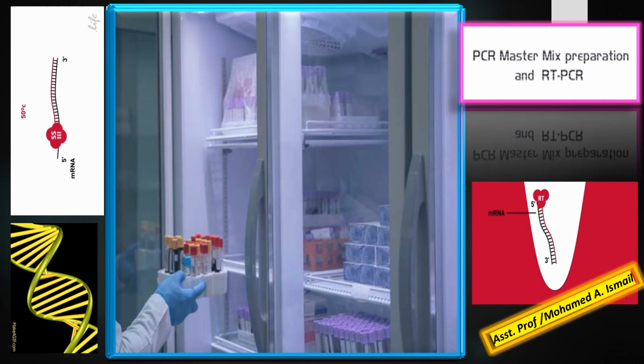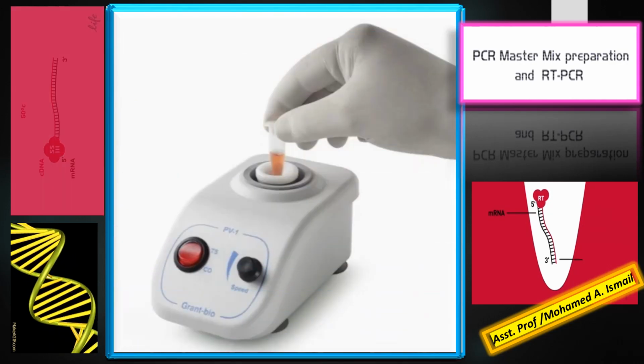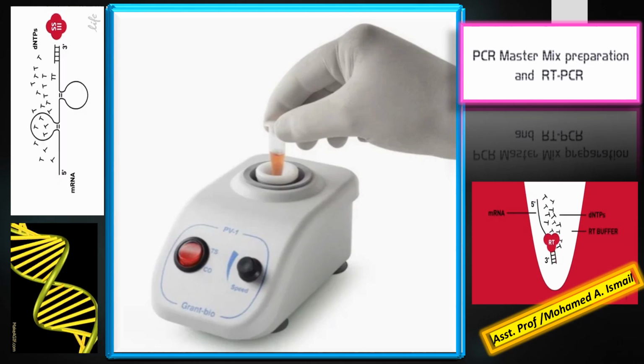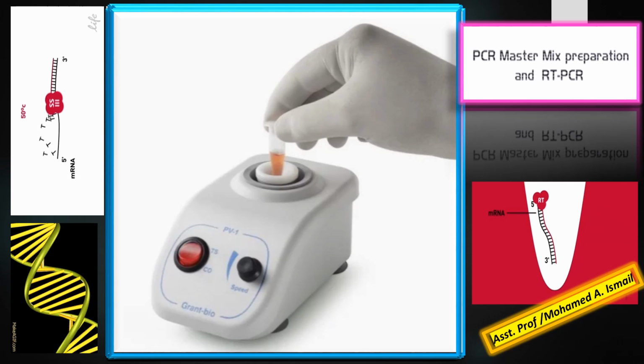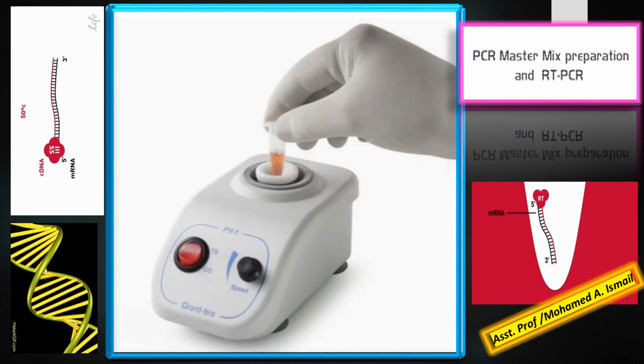Please vortex and spin each reagent before use to avoid pellets of material forming in the tube.